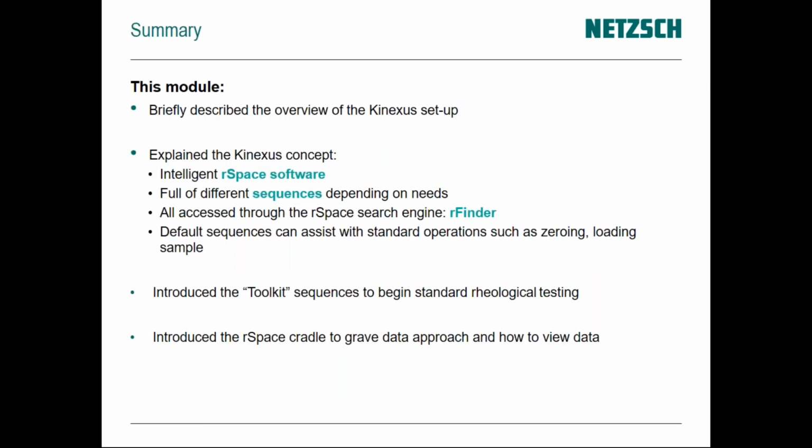So it takes a little bit of playing with, and I wouldn't be afraid of it. You're not going to break anything. There's also a simulation mode.